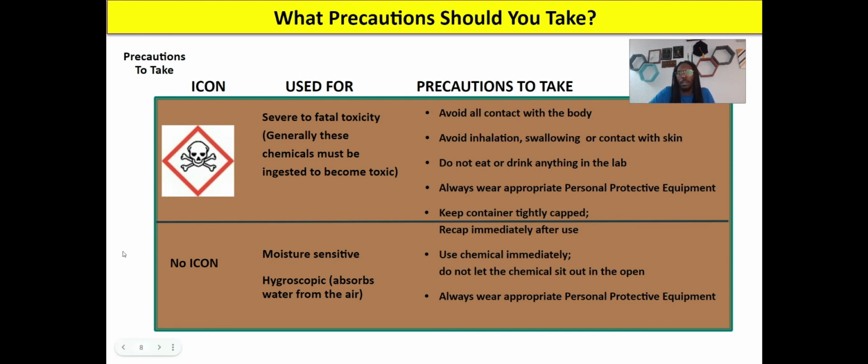So the reason why we want to keep it capped, depending on where you are, in this case, we've got water in the atmosphere. So water can definitely degrade that material, those chemicals. So you always want to make sure it's always capped on.